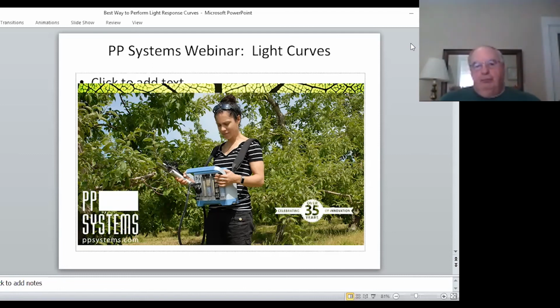Okay. In measuring dark respiration of leaves, how long do you practice dark adaptation of leaves? That's an interesting question. I don't think anybody has a real firm answer to that. Some people think you need to wait like half an hour after you turn the lights out before you get a really stable dark respiration rate. I think you need to wait at least a few minutes after the light goes out. But in my experience, dark respiration changes all night long, so there's no point in waiting too long because it's never going to be constant.